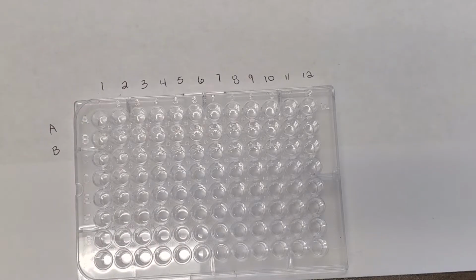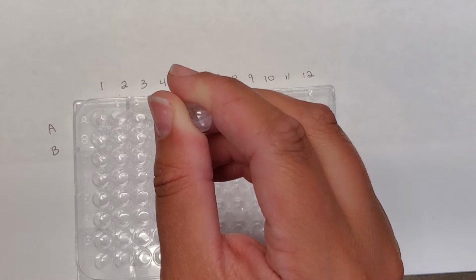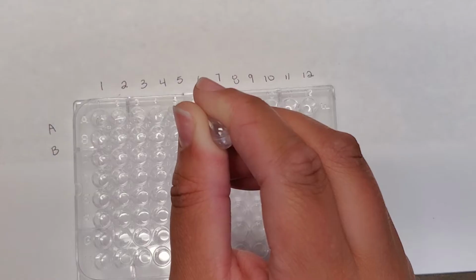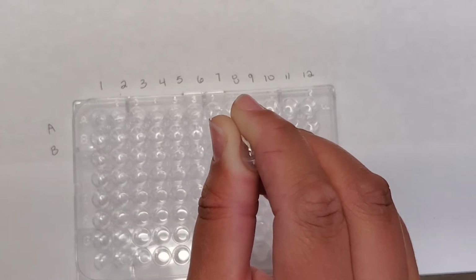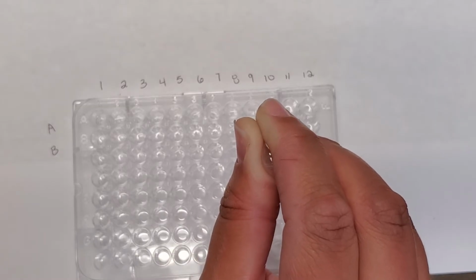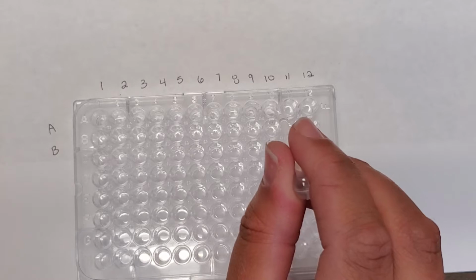So the first thing that I'm going to do is take 3 drops of the simulated antigen, and add it into each one of these wells. And as I'm adding the simulated antigen, I'm making sure that I'm not actually touching the pipette into each of the wells, the main reason being that we don't want to have cross-contamination. So I'm just going to start that practice immediately as I start this process. So once again, first thing that we're doing is adding 3 drops of the simulated antigen into each one of the wells. And again, that is rows A and B.